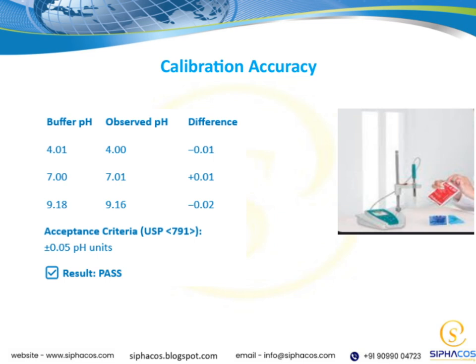That's why regular calibration checks and adjustments are essential. They help us maintain that high level of accuracy over time. So, when we think about calibration accuracy, think of it as the foundation that supports the integrity of all our measurement processes.